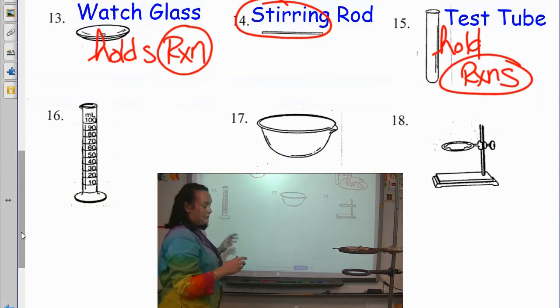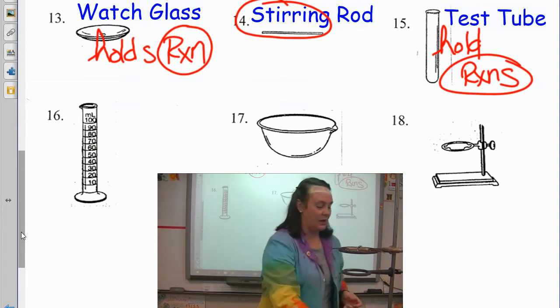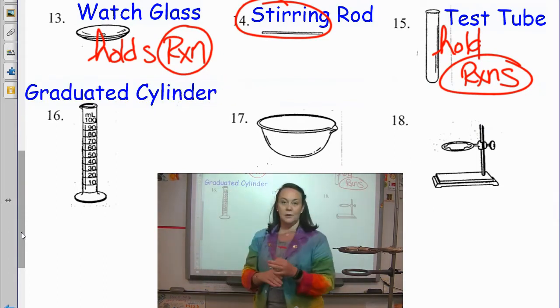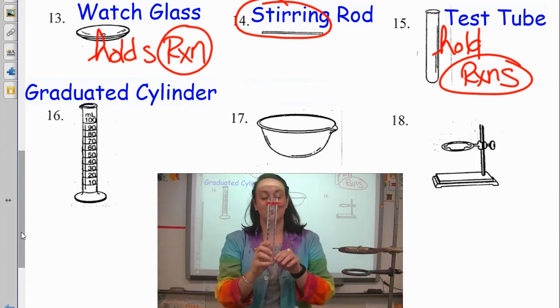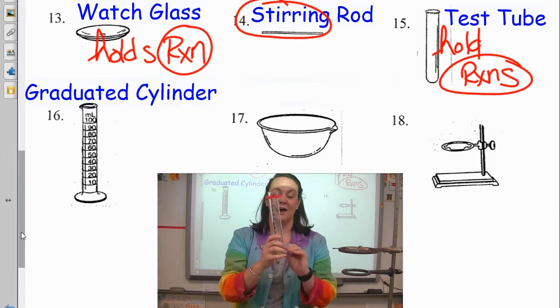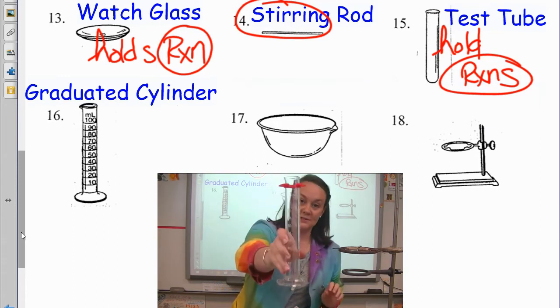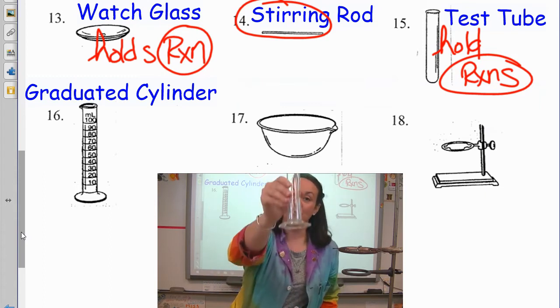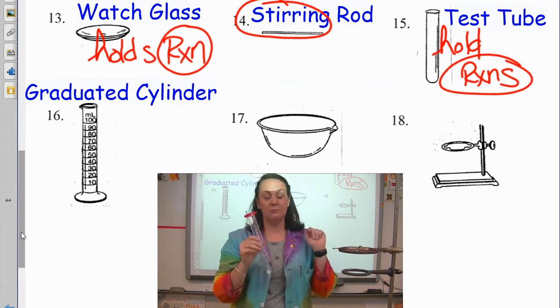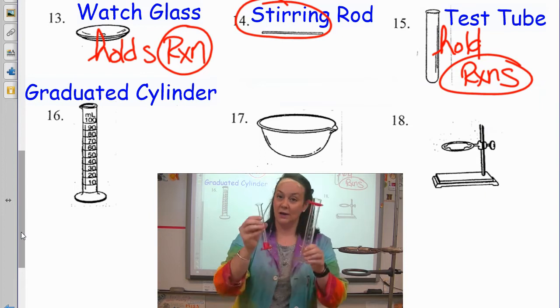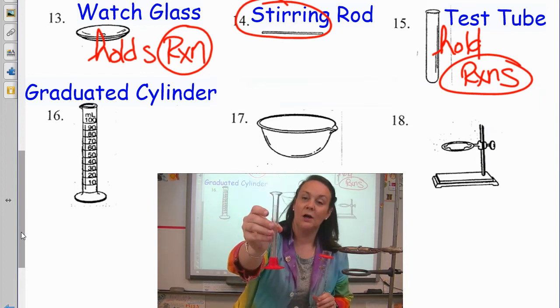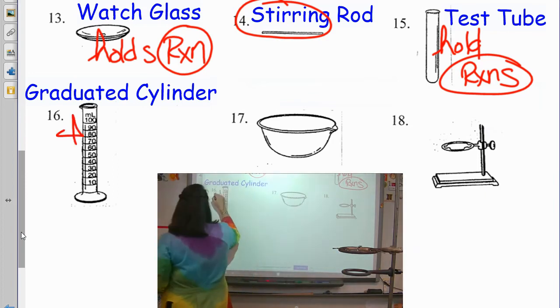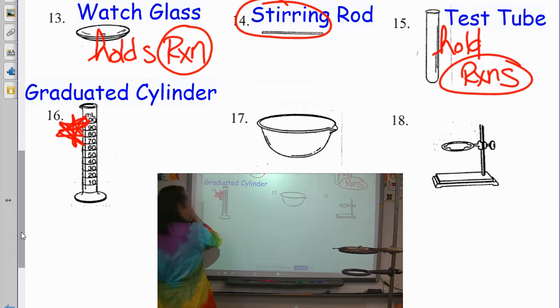16. Hopefully everybody knows what 16 is. It's a very smart cylinder. It is a graduated cylinder. I know I'm hilarious. It's called graduated because it's got graduations on the side. It has the markings. This is the only thing besides the burette that you will use to measure volume in this class. So, if I say, hey, go get 10 milliliters of sodium hydroxide, you are getting a graduated cylinder to measure liquid.